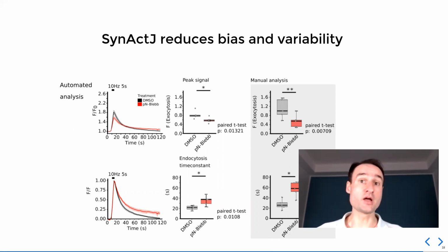Overall, we were therefore able to demonstrate that simple, accessible, and automated bioimage analysis tools can effectively overcome tedious manual analysis, ultimately improving the overall accuracy and precision of the analysis.